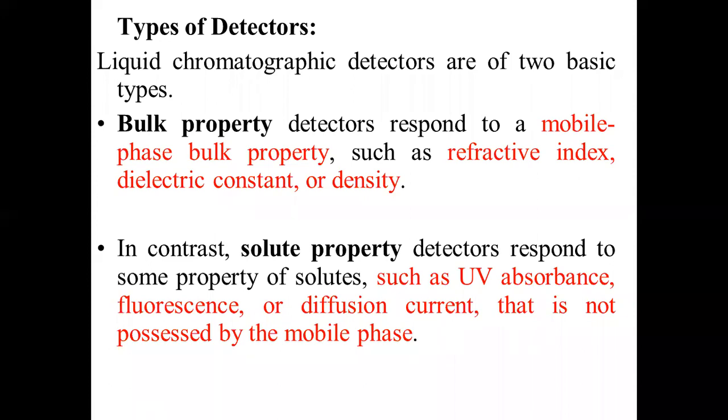So as the solute reaches the detector, if it is a UV absorption detector, it will show the absorption, what is the amount of the light energy absorbed by the species. And this may be due to the conjugation, the length of the aliphatic chain, or the number of aromatic rings present in that particular compound. So are the number of conjugated bonds present in that particular organic compound, whatever it is, d electrons, f electrons present in that. So they decide the color, or they decide the absorption in the UV region or in the visible region. They have the capacity to absorb light radiation either in the UV region or in the visible region. You know Beer-Lambert's law for this. I need not explain further about this.